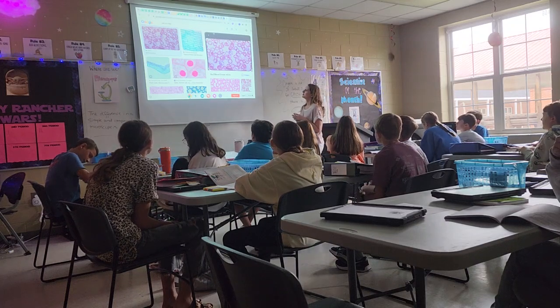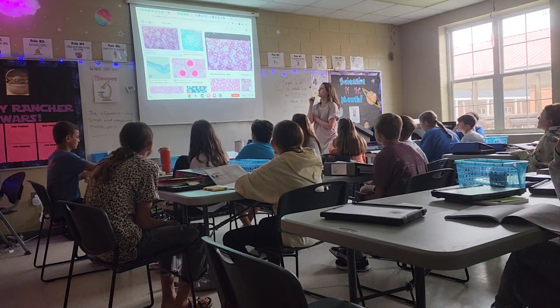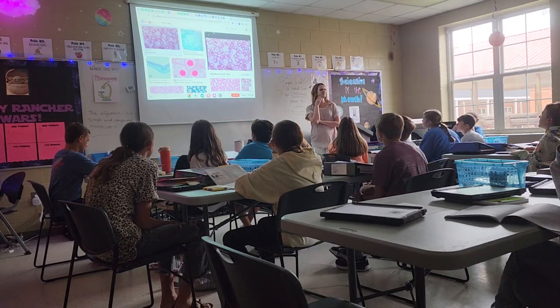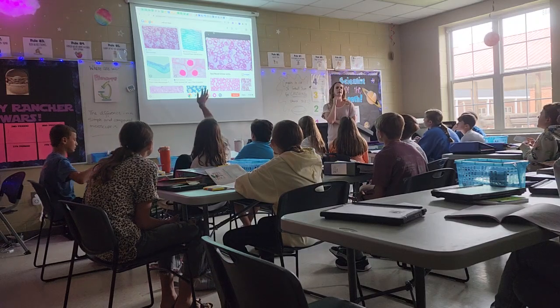But let's look at these pictures. What do you notice about these? All of these pictures are cells. Do they all look the same? No. What are some things you notice that are different about these cells?